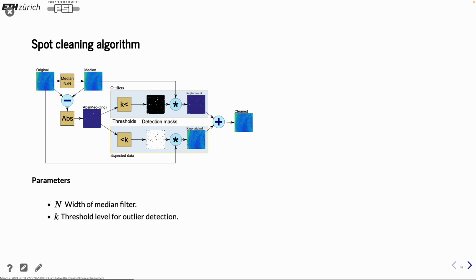You can do it based on the histogram. That's actually next week's lecture, but anyway, if you look at the histogram of this detection image, so this would be the detection image, it looks like this: you have a very high peak here, and then it goes slowly out to almost nothing.